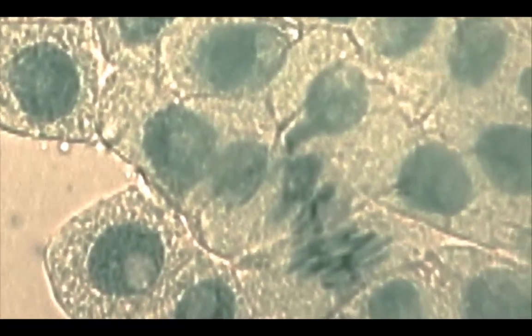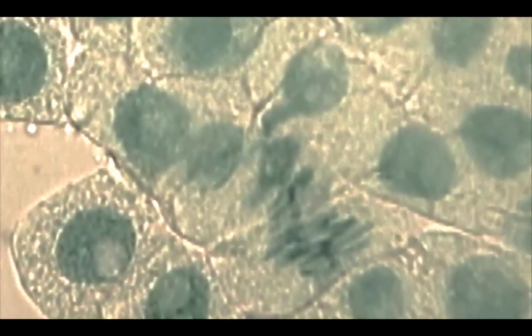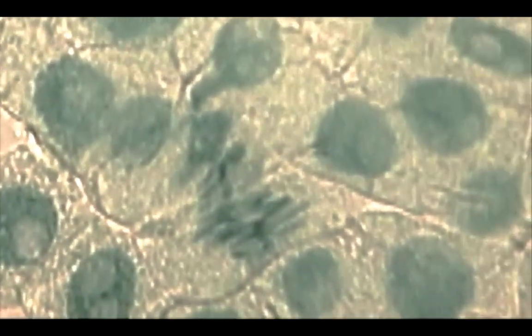Here we are seeing clear evidence of metaphase, where the chromosomes, each existing as sister chromatids, are lining up along the equator of the cell.